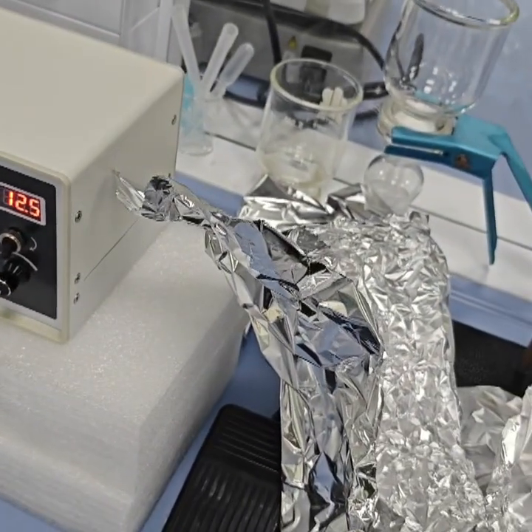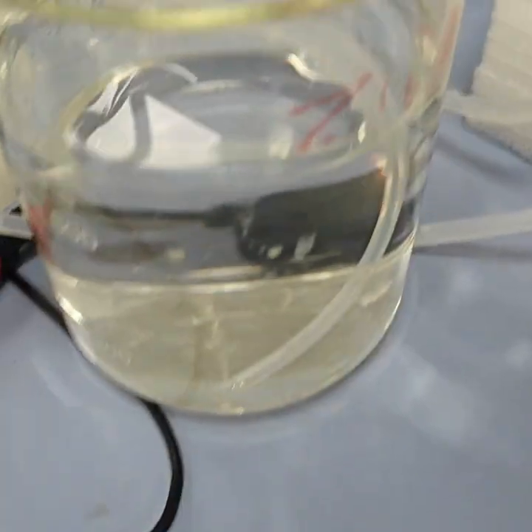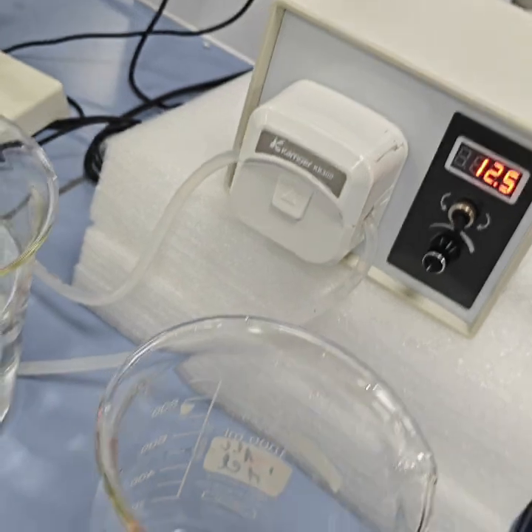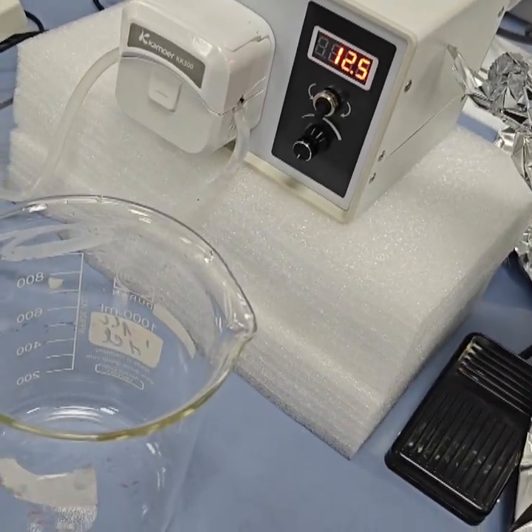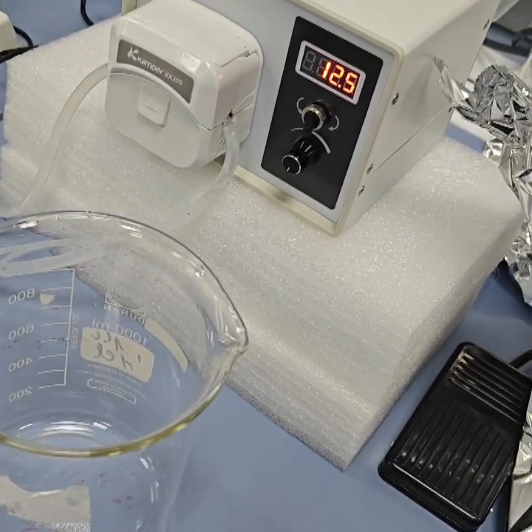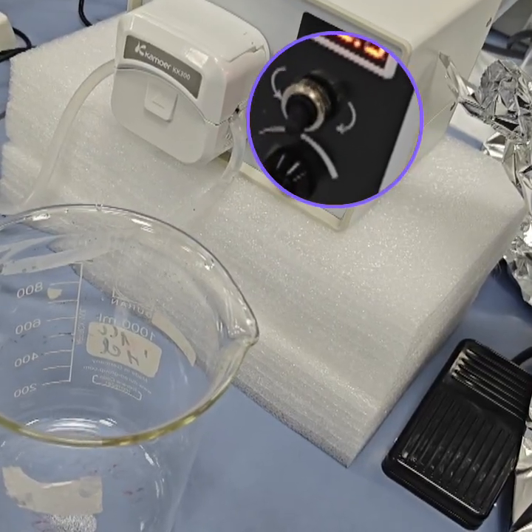This is my influent reservoir. It contains the pollutant solution, so it could contain dye, antibiotic, or dairy wastewater. What is your target pollutant? It can be single pass or recirculated. Here we are recirculating. The pollutant solution is continuously drawn from the feed reservoir or the reactor tank.